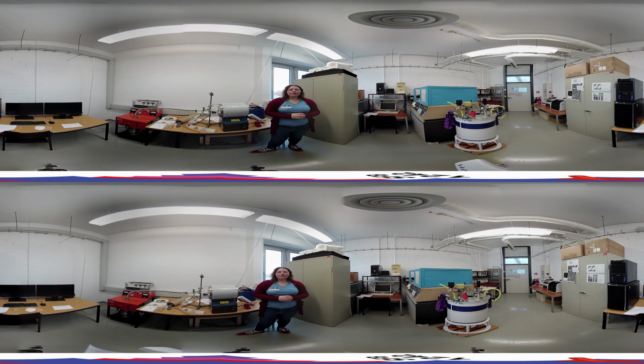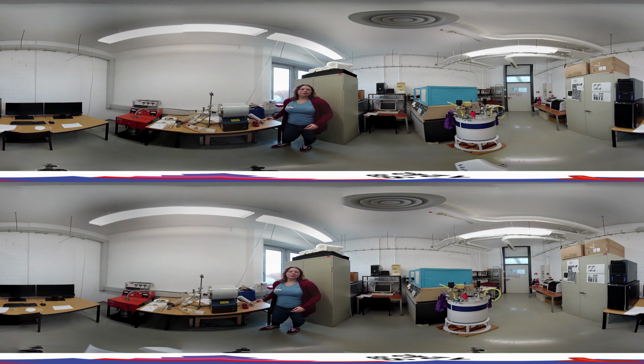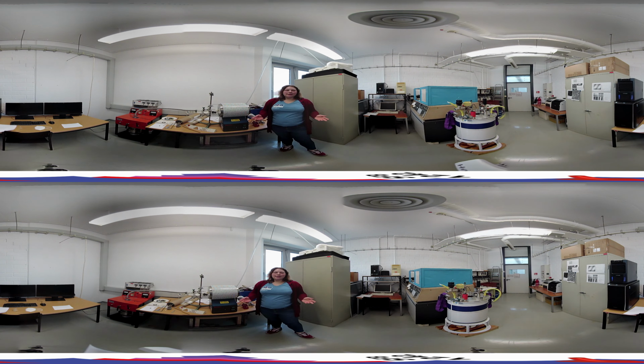Here we see a tube oven which can heat samples at temperatures up to 1200 degrees centigrade. Using an oil diffusion pump, we can reach a fine vacuum inside the tube. By opening this needle valve here, it is possible to let gas stream into the tube. By this means, we can simulate the conditions for dust particles in the early stages of planetary formation.